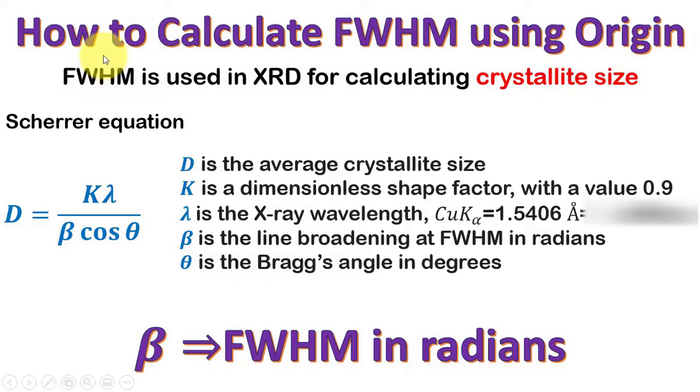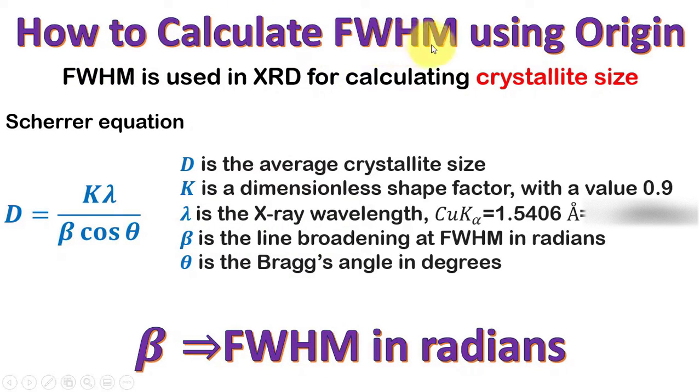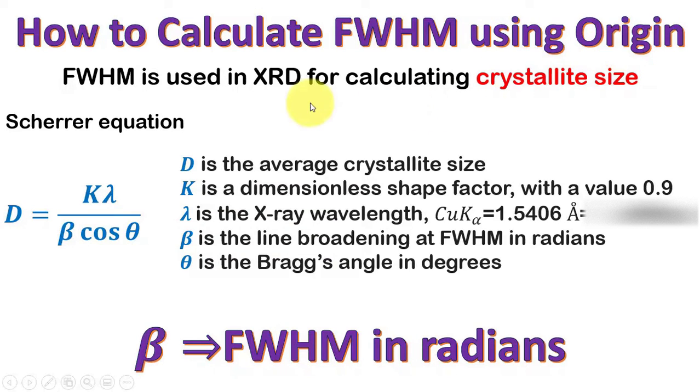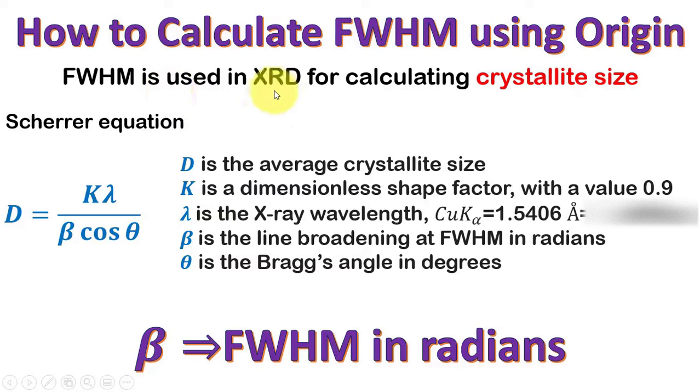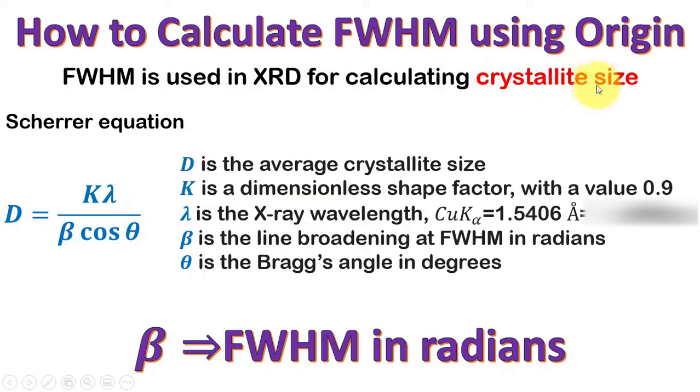In this video we will discuss how to calculate the full width at half maximum using Origin. We know that the FWHM is required from the XRD data to calculate the crystallite size.